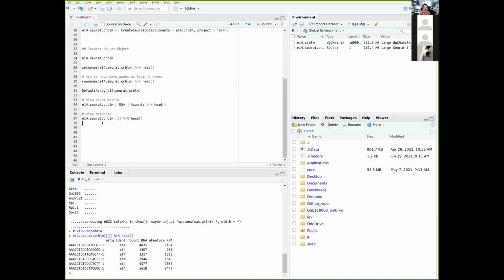There is another way to do this. This is the same. I like this a little bit more because it doesn't deal with these square brackets, which I don't really like, because it's always confusing between square brackets. And if you understand R and its syntax, square brackets is usually subsetting, so it's a bit confusing.